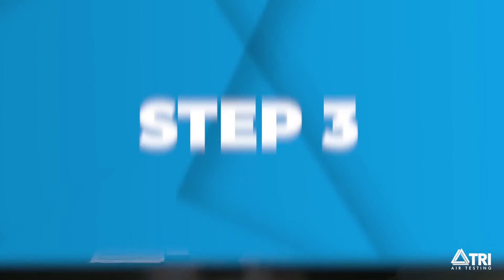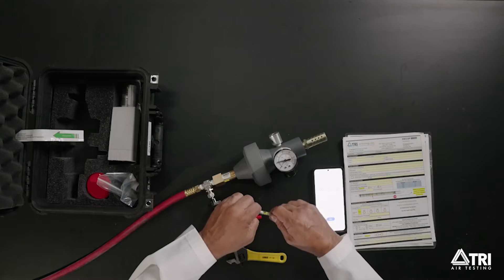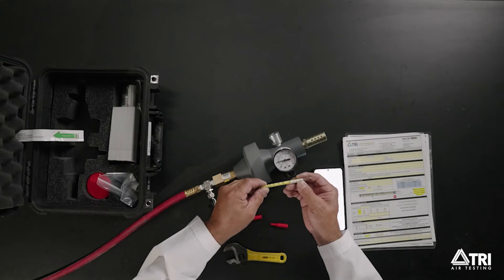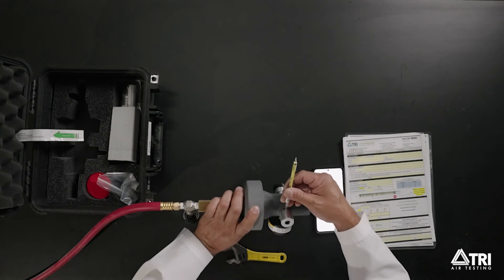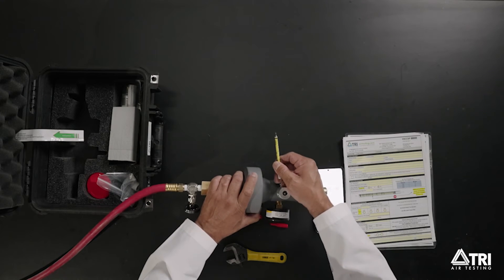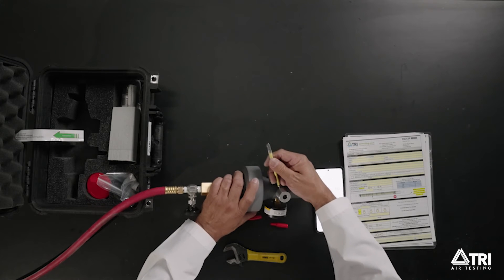Step 3. Grab the moisture tube and remove the red caps. Find the end marked Insert Other End. Carefully break the glass tip off this end by inserting it into the hole on the side of the tube fitting and gently apply sideways pressure. Then break the other tip off the same way. Make sure you break both ends.